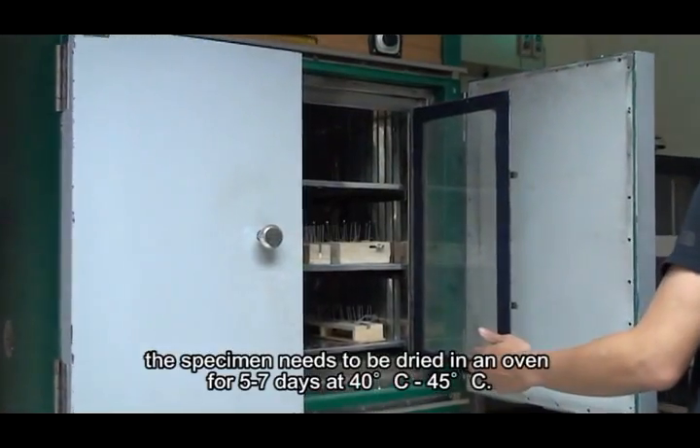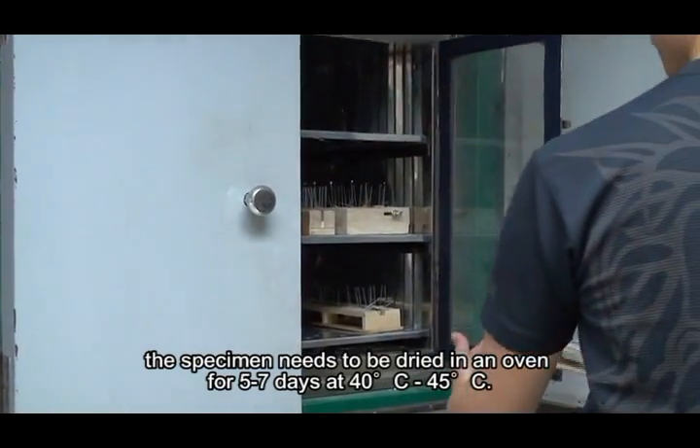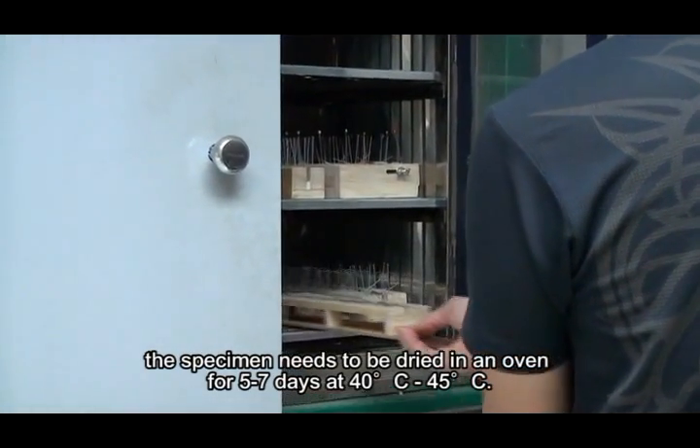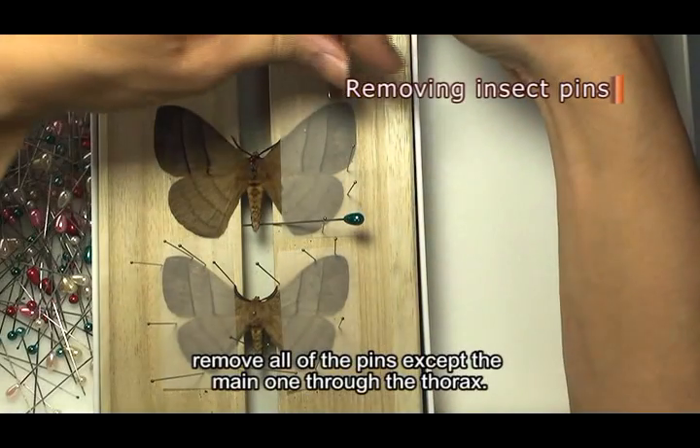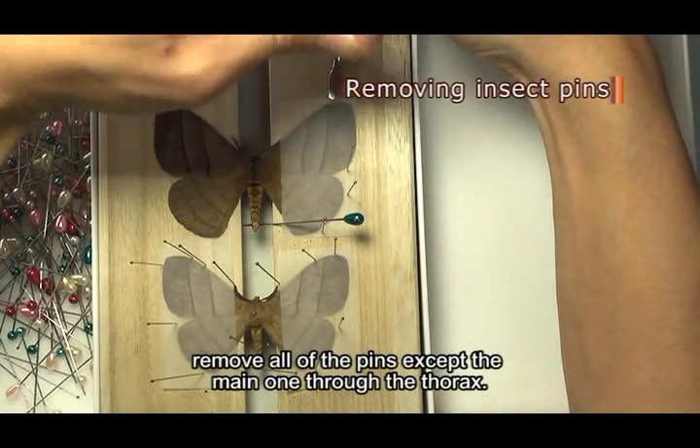Once in place, the specimen needs to be dried in an oven for 5 to 7 days at 40 to 45 degrees Celsius. The length of the drying process may vary depending on the specimen. When dried, remove all of the pins except the main one through the thorax.